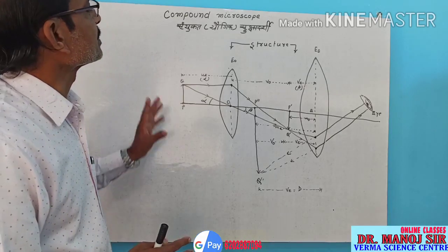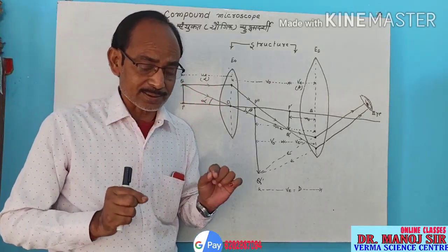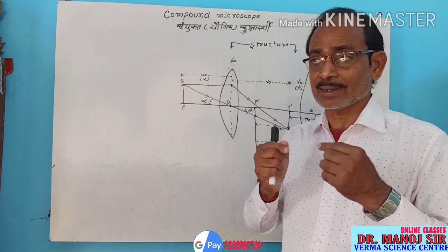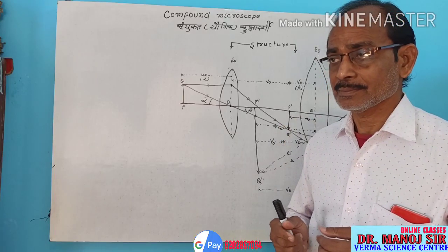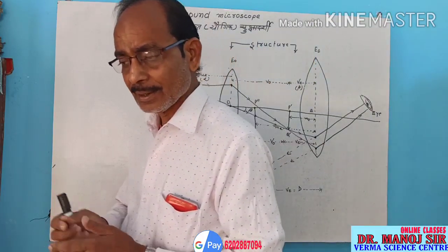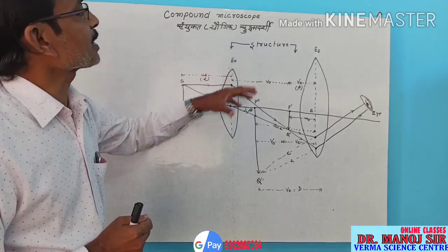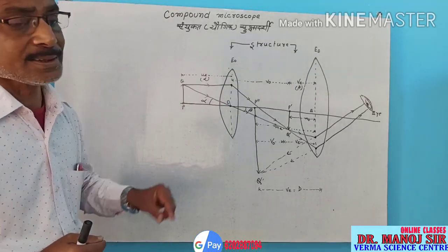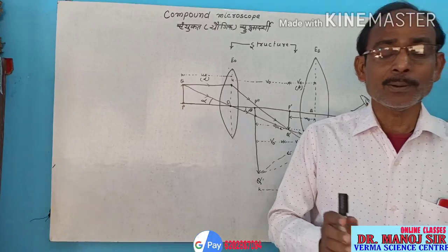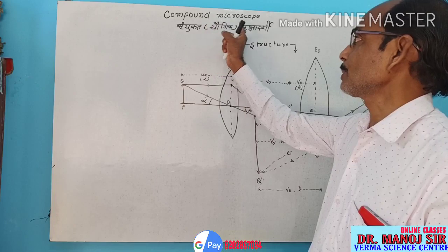As many of things, suppose some of the particles go inside our eye, go inside the throat by any means, and go inside our ear. We have to detect their position, their depth and their local appearance by this compound microscope.